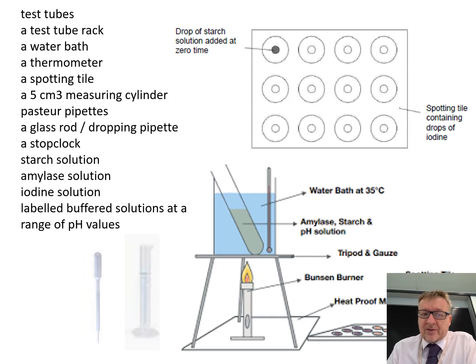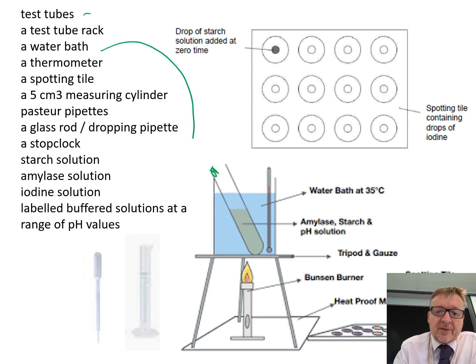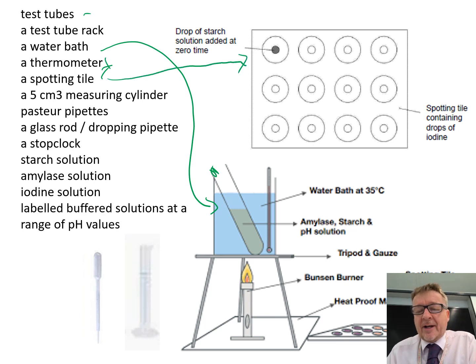To go through equipment — there's quite a lot involved. Firstly, we've got test tubes and a test tube rack. We've got a water bath, which is the beaker here, which we keep at 35 degrees C, and a thermometer to make sure it stays at 35 degrees C. There's also a spotting tile — a white plastic tray with 12 dimples in it.